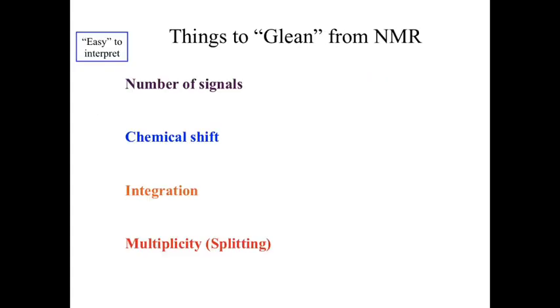So the next part of this is HNMR, or sorry, NMR in general. So what we're dealing with in NMR is the spin of a nucleus. So we've been able to build instruments that can cause our nucleus to change its location or change its spin rate, and that's kind of neat. And the way I like to look at these is that we really have 4 pieces of information that we can pull from NMR.